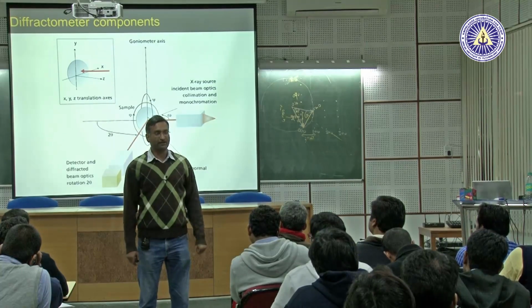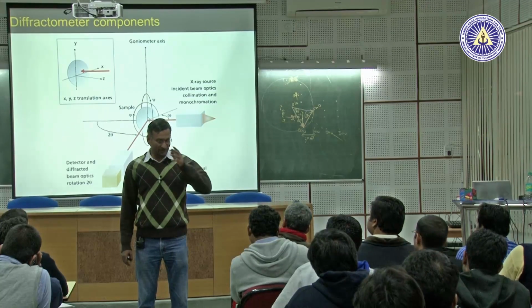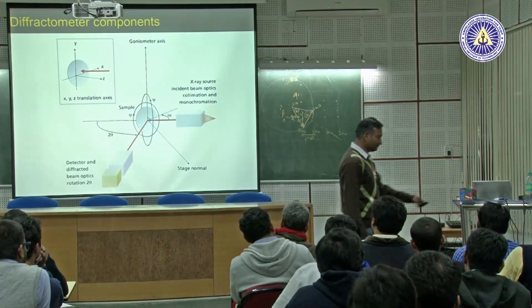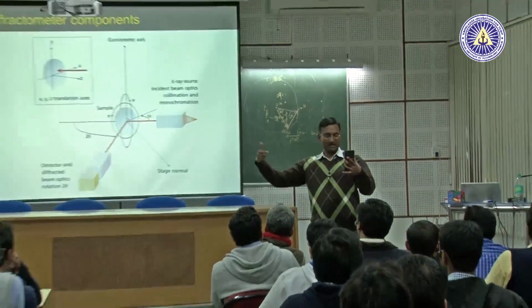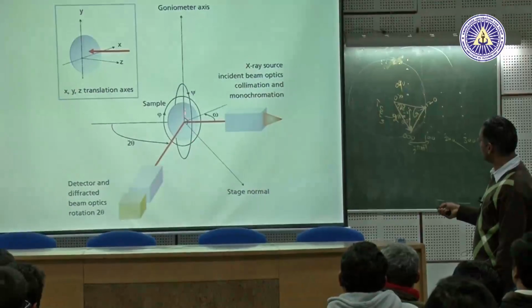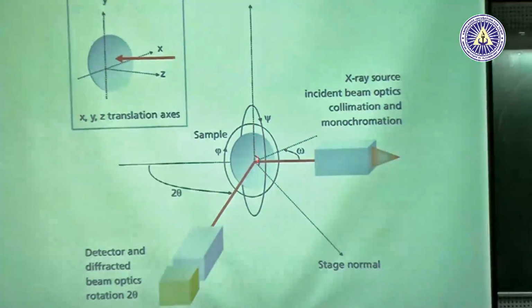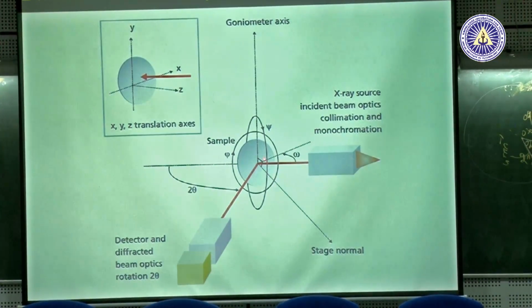Most of my reference point is the diffractometer, which is a typical thin film diffractometer, the MRD Pro of PANalytical. In that, the sample stage is typically vertical, and this is the beam that hits it, and somewhere along this direction you have the detector. If you put that into a circular or plate-shaped form, this is your sample stage, which is vertical. The axis which coincides with the surface of this plate is the goniometer axis. This is the stage normal.